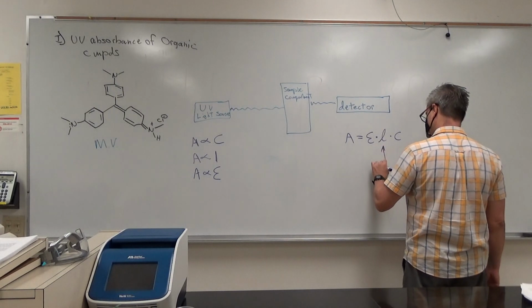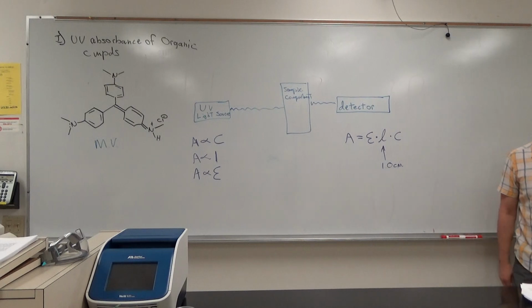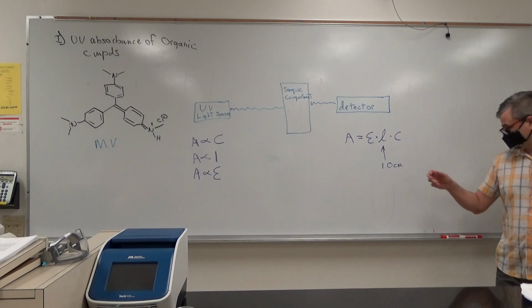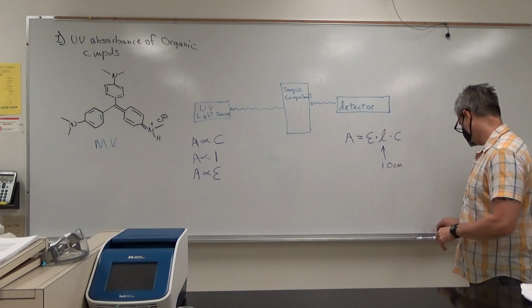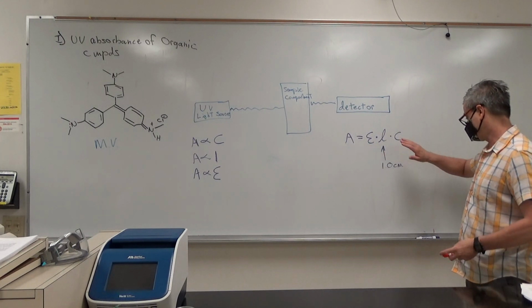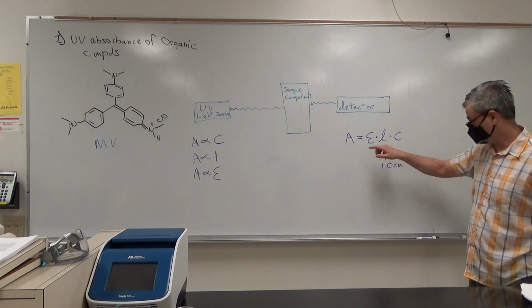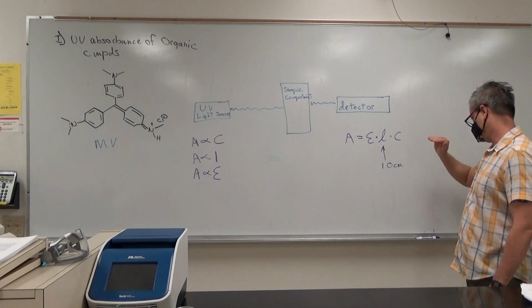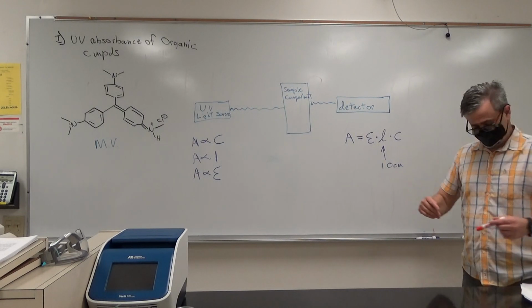I'm 99% sure. That's 1.0 centimeters. That way, numerically, it won't affect your values. It's just multiplying by 1. So you can almost discount that when you're examining the form of this equation. That's a constant, and that is a variable. That's our independent variable. This is our dependent variable. So dependent variable equals a constant times independent variable. What does that resemble? The equation of a line.